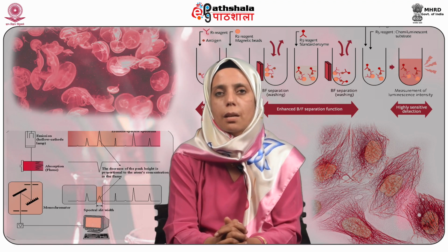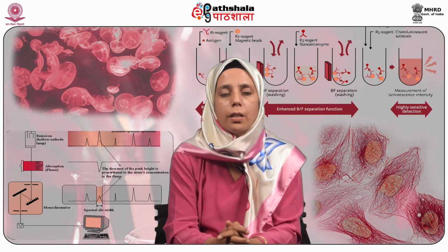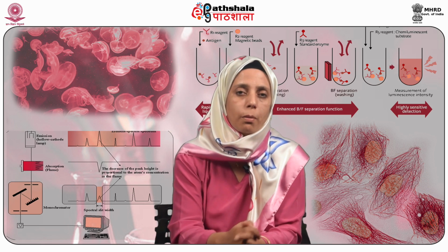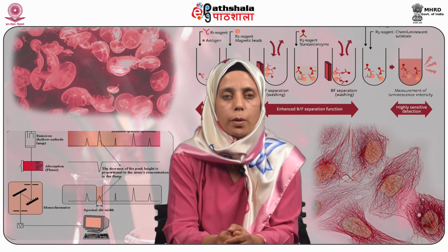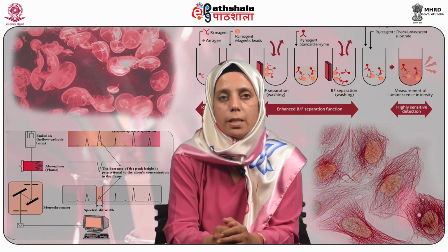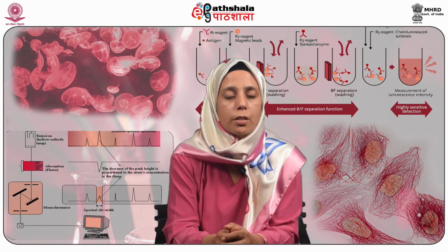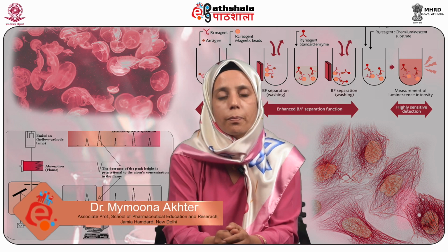So students, let's summarize what we have learned in this module. We have brushed up the basics of atomic absorption spectroscopy. We have discussed the various parts of the instrument used for measurement of the light generated in atomic absorption spectroscopy, various types of nebulizers and atomizers used to create the mist, the importance of burner and nebulizer along with the sample atomizer, and the various types of monochromators used, the gratings and prism monochromators, and their advantages.